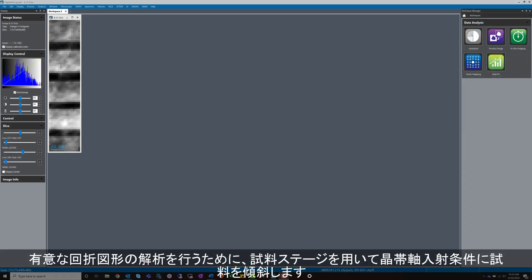To perform meaningful diffraction analysis, it's typical to use the microscope stage to orient the specimen or part of the specimen to what is called a zone axis orientation.